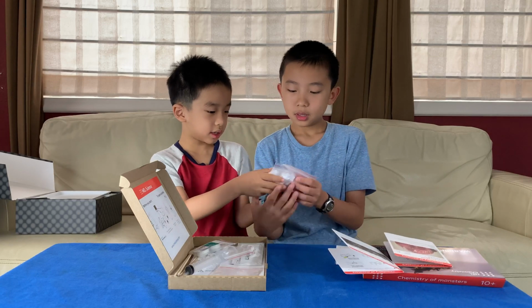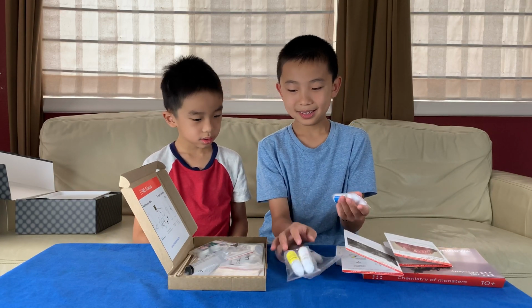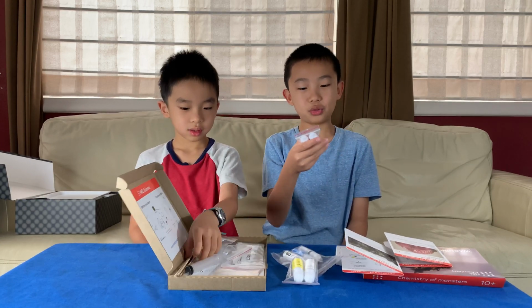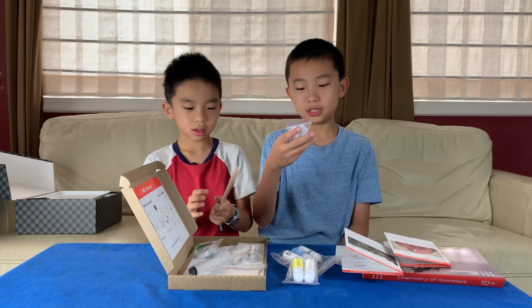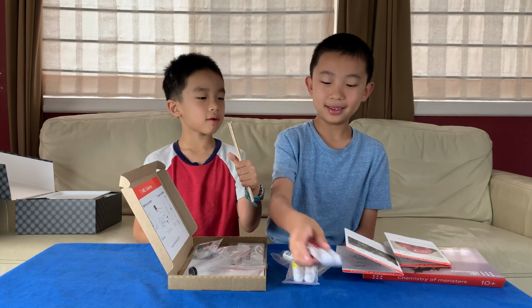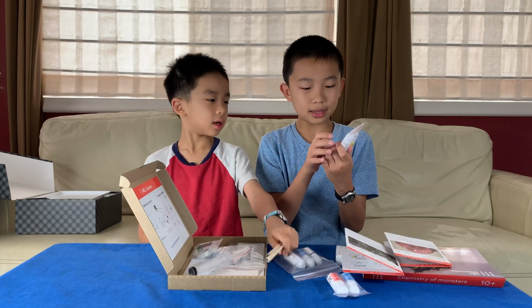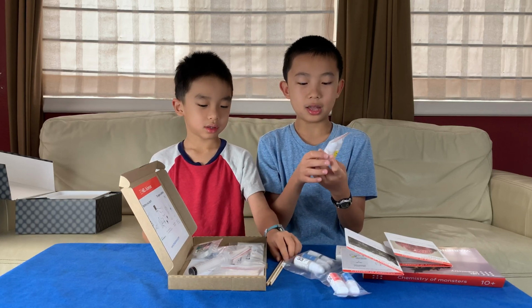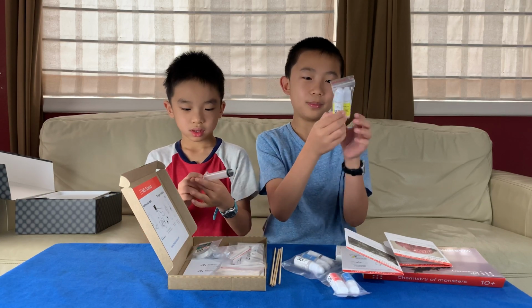What? All these. Oh, wow. There's a lot of... We better not drop these. Okay, so over here is Na2CO3, sodium carbonate. And there's also citric acid, which is C6H8O7. 4 wooden sticks. Wait, there's another pack. This one has sodium hydrogen carbonate, NaHCO3, which means baking soda, and another bottle of baking soda.